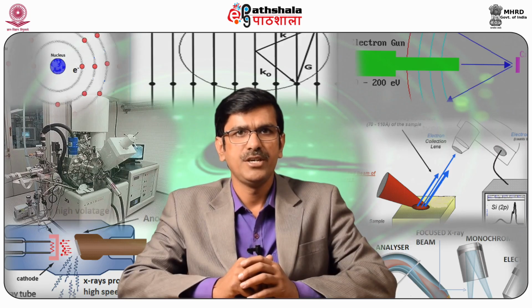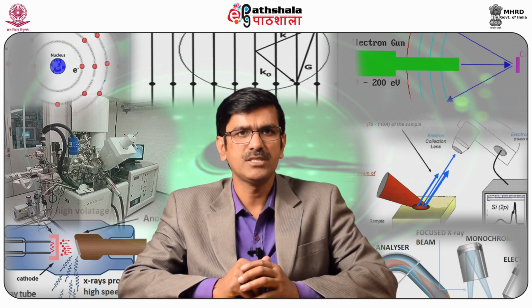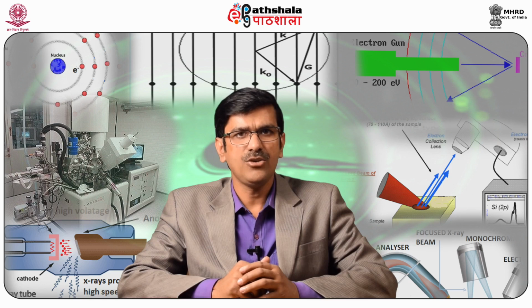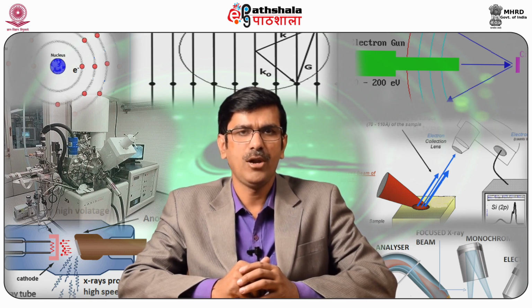From the last figure, it can be seen that binding energy, or BE, can be defined as the energy difference between the initial and the final state of the species containing the core hole. BE is an intrinsic material property of the photoelectron and does not depend on the X-ray photon source. Binding energies of elements show slight variation and depend upon the exact environment of the atom, ions or molecules.